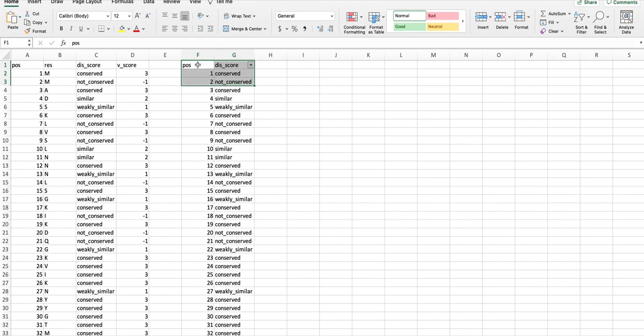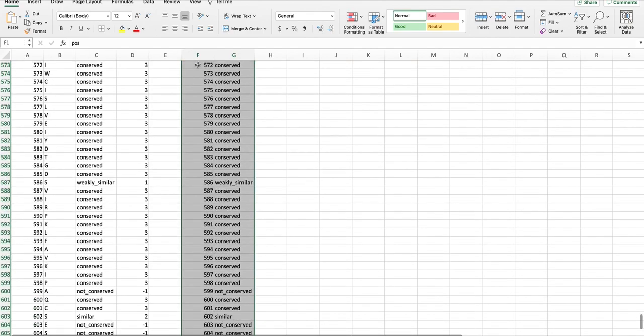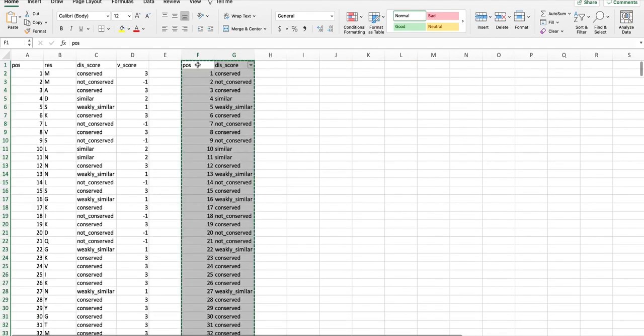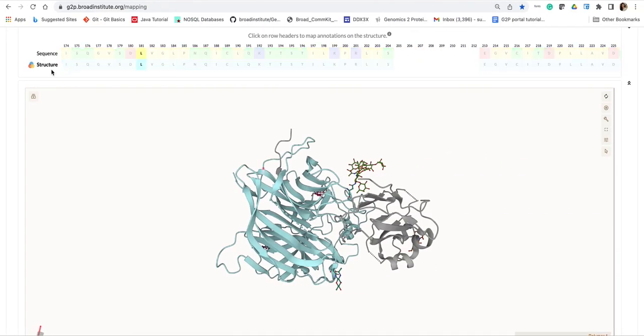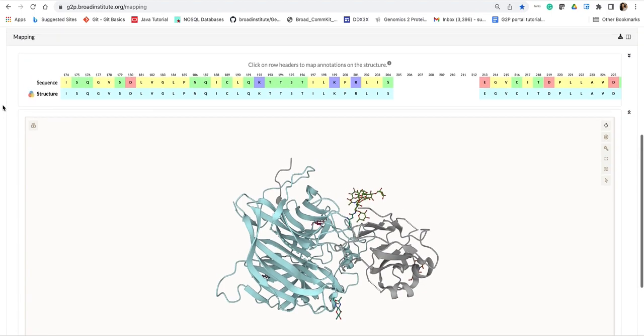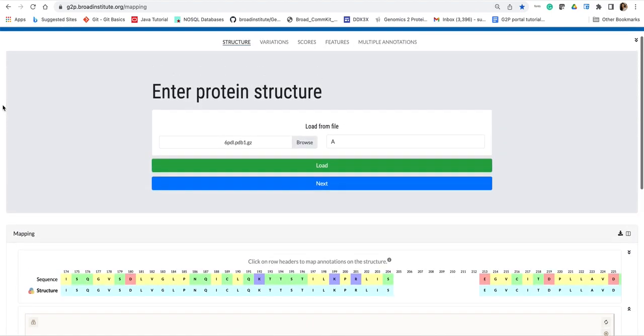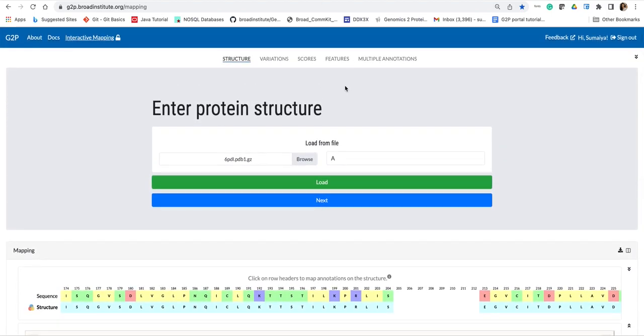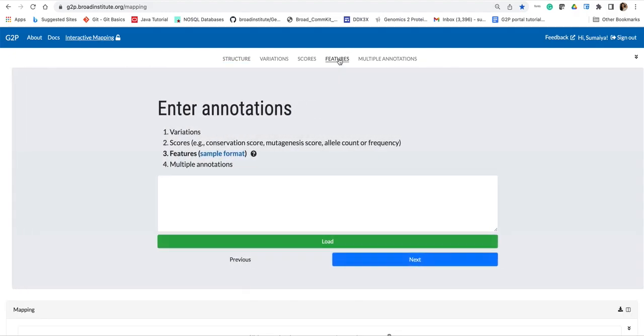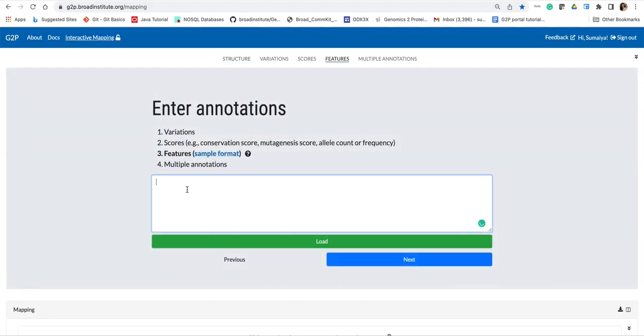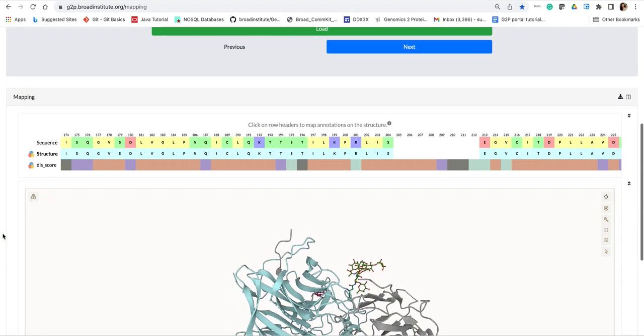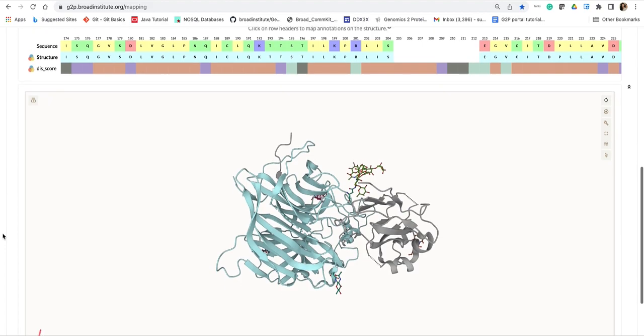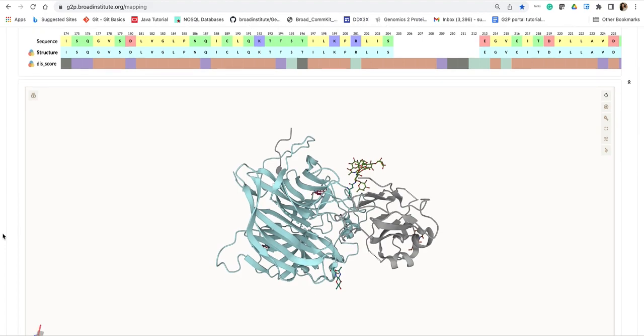I will copy these annotations from the Excel file and then go to the portal and navigate to this feature mapping capability. I will just paste the annotations that I just copied and then hit load. Now you can see that the annotations have been mapped onto both sequence and structure.